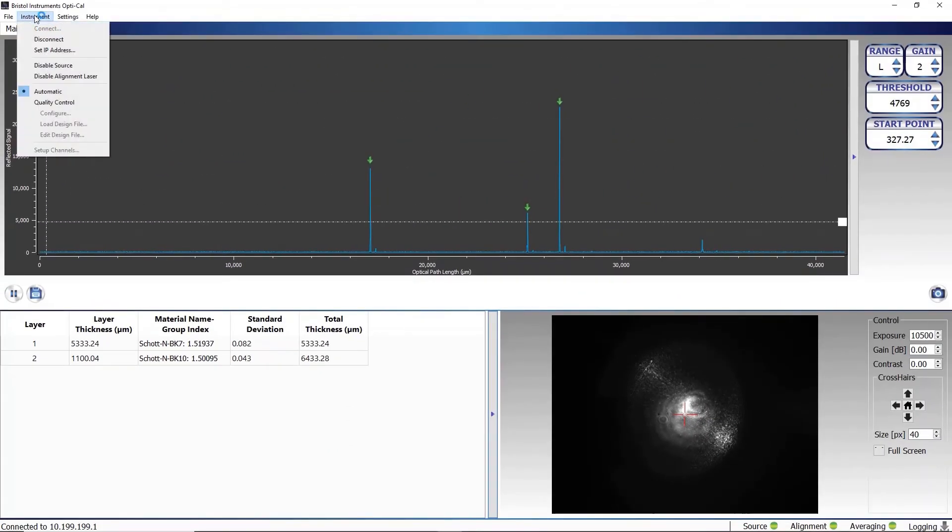The OptiCal software also includes a quality control mode that can be used to compare the real thickness of a sample to a design thickness.